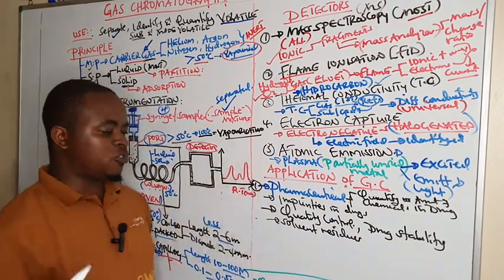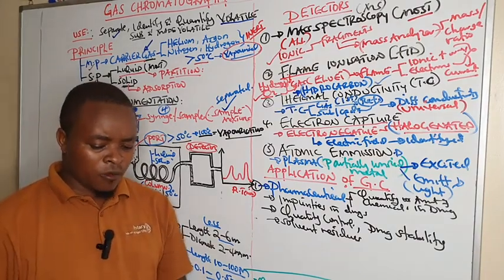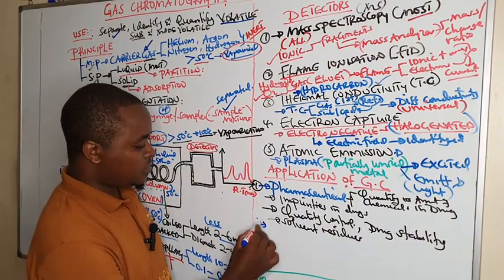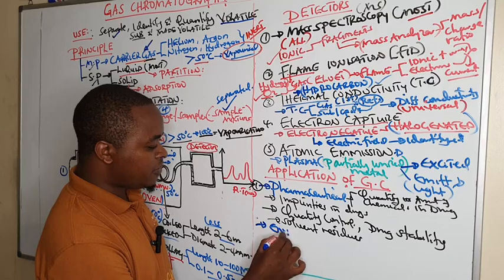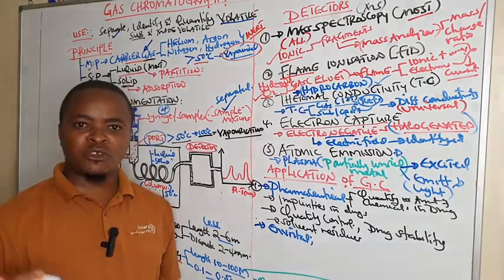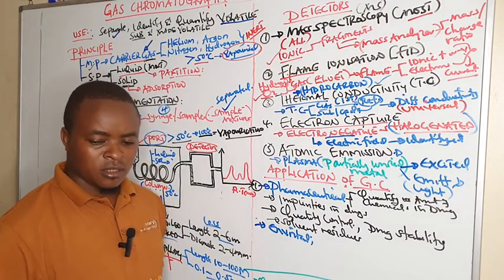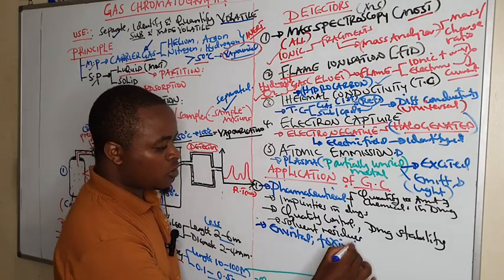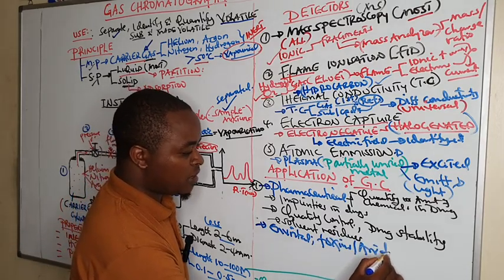But apart from pharmaceutical industry, we are also applying this in environmental health, whereby we are using it to determine levels of toxins or air quality in the environment.